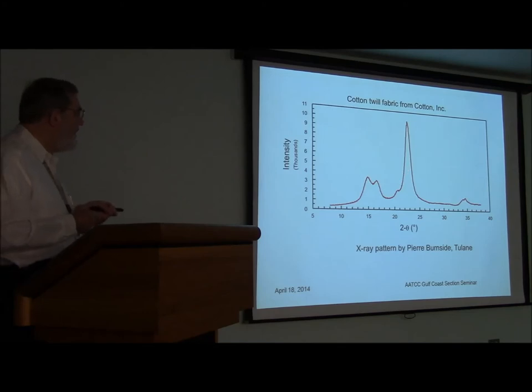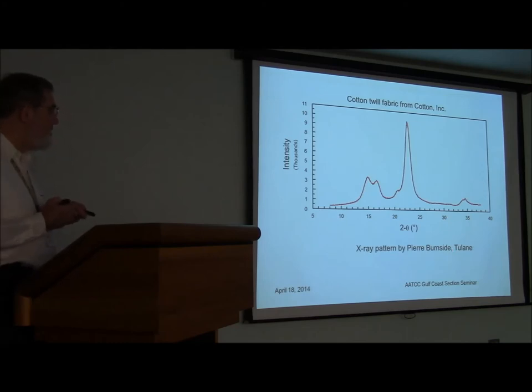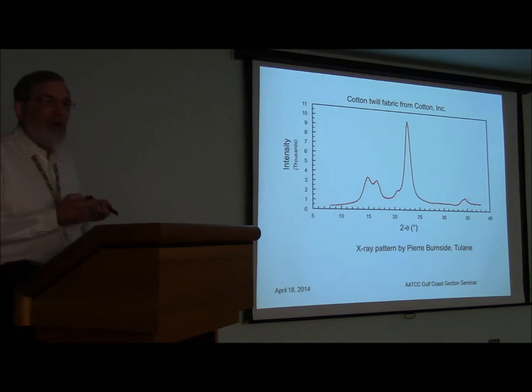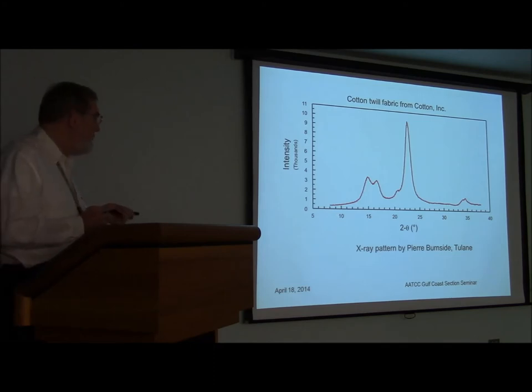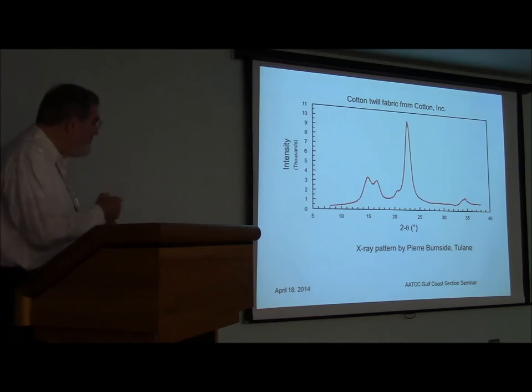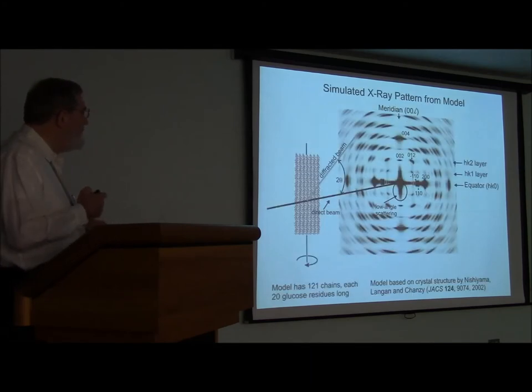This is a typical powder diffraction pattern that we can get from either Pierre Burnside down at Tulane's instrumentation group over at UNO and John Wiley's group. Either one of them will do diffraction for us. We've had at least three diffractometers over the years at SRRC, but we got rid of them all for various reasons.